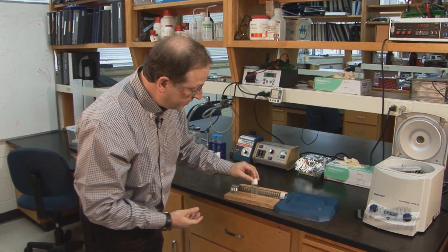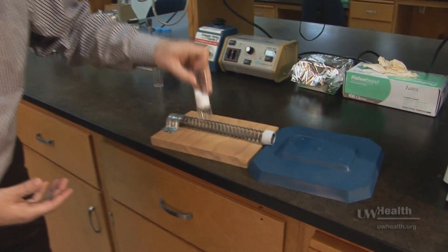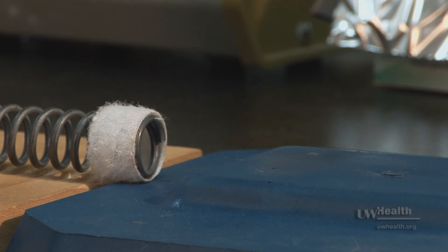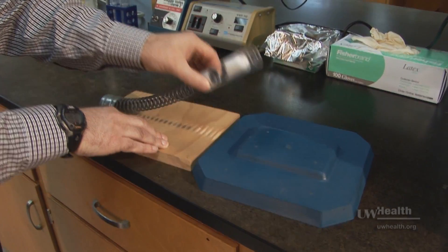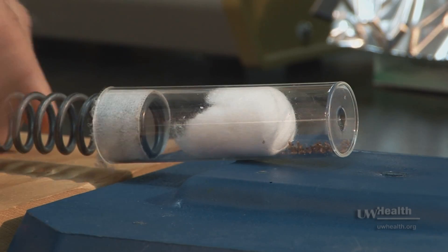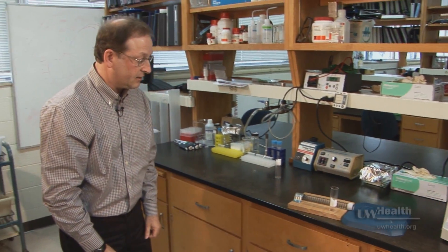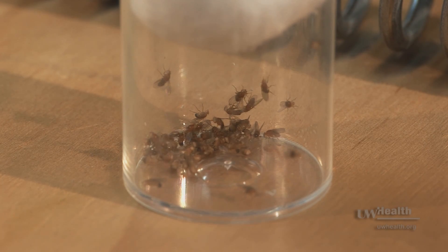We knock these flies down to the bottom of the container so they're all still moving around. Then we attach the container to the end of the device, deflect the spring always to 90 degrees, and release it. A large fraction of the flies are now immobile — sitting at the bottom of the container — and they will remain that way for up to five minutes before they recover.